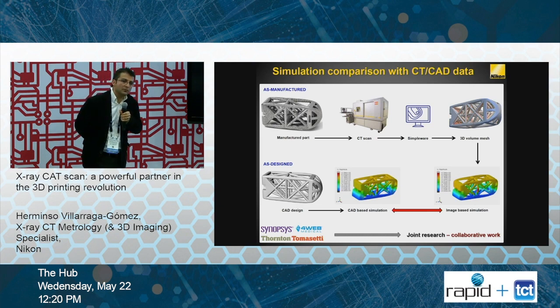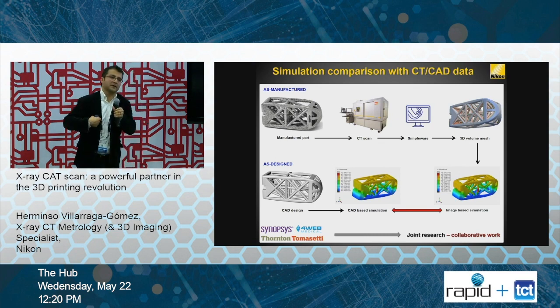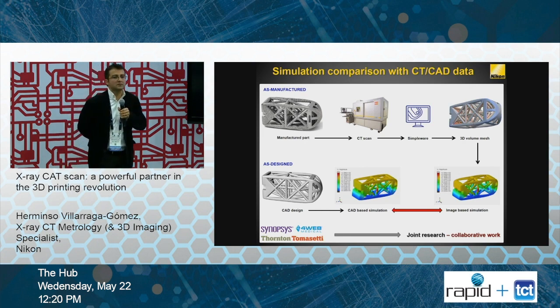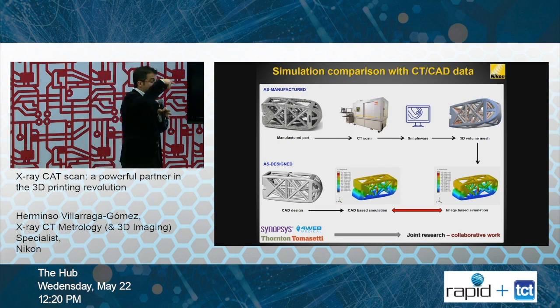But with any biomaterials? So that's metal. Yeah, no, not that we have scanned, but if you have one part, we can talk. Okay, thank you. We might be able to do that. I have had customers that bring me the part already inside of a bone and in a liquid, and we have to scan that to see how much of the bone has grown around the part. And so we have done that, to calculate the volume of growth around the part for your knees or for your bones.